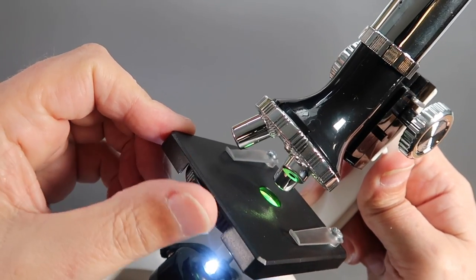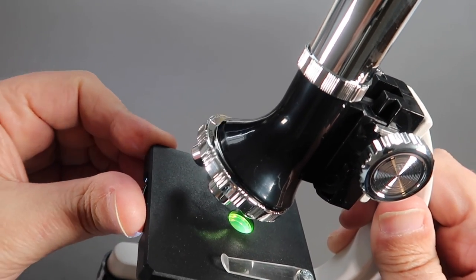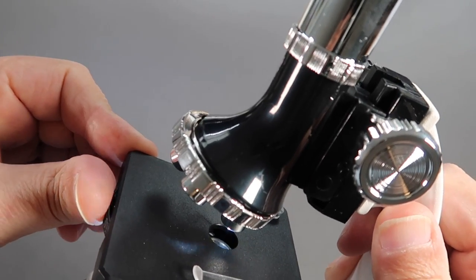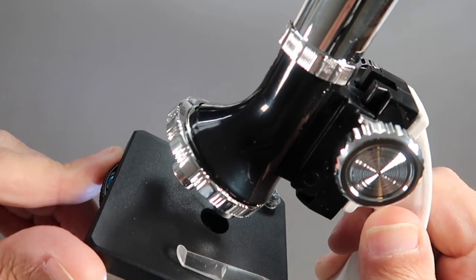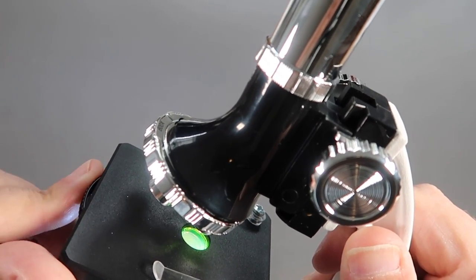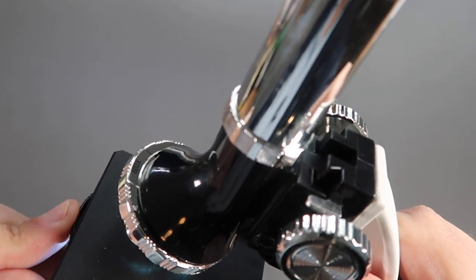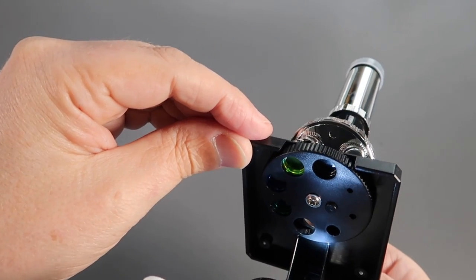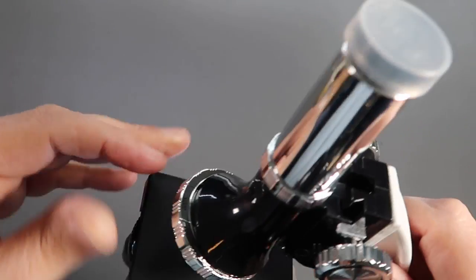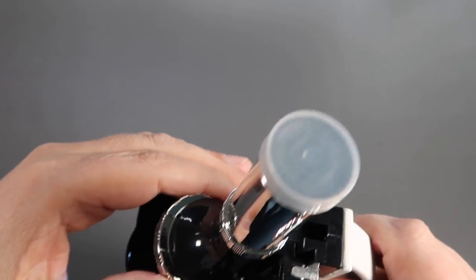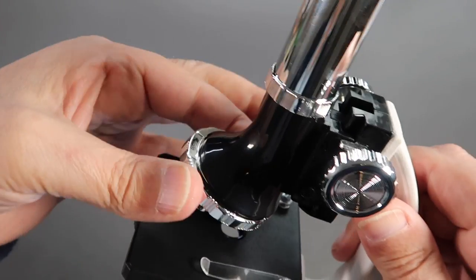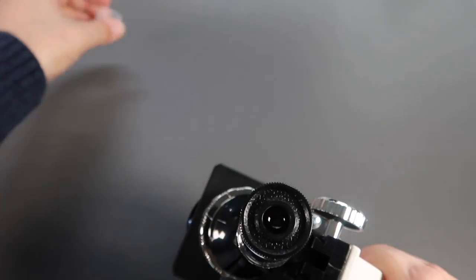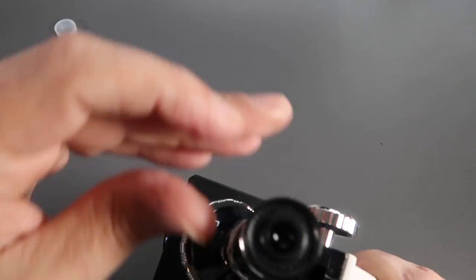This slider on the front of the stage alters a colour filter, which you can probably just see there in the stage. There's a green and a blue. And then of course the dial on the front here is the magnification, which multiplies the magnification of the eyepiece. This is 6 times.